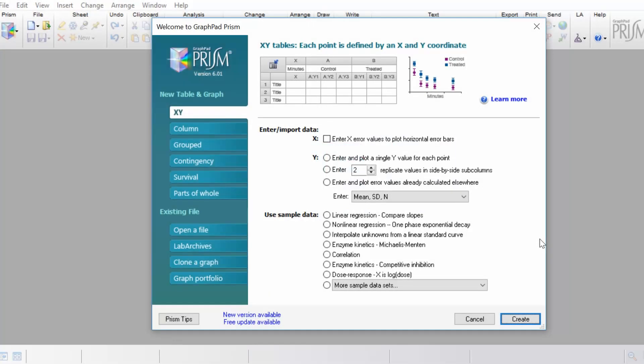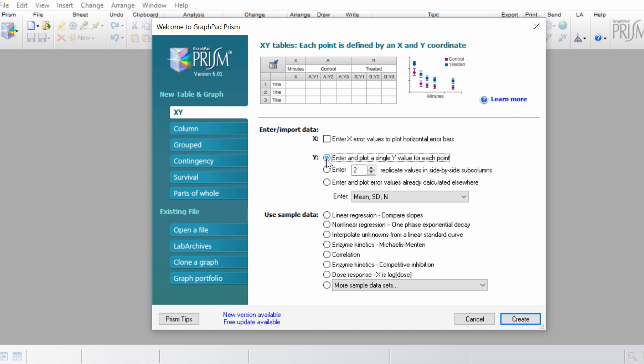So with GraphPad open, I'm going to select the X, Y table and graph type. Then under Y, I'm going to select the option that says enter and plot a single Y value for each point, and then I'm going to click the create button.